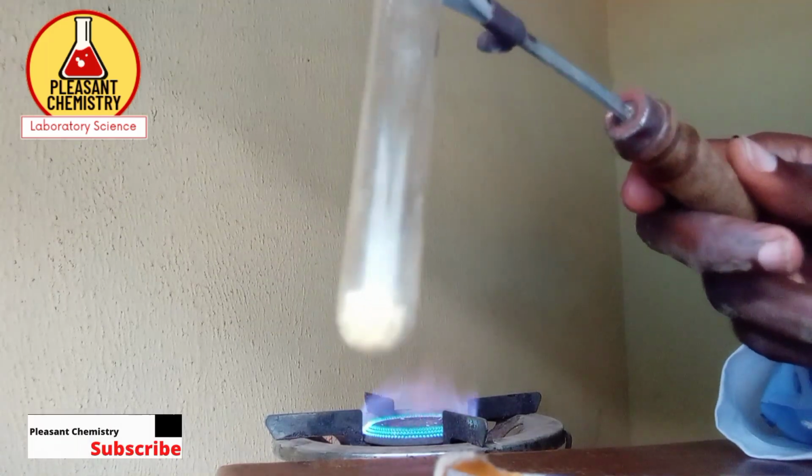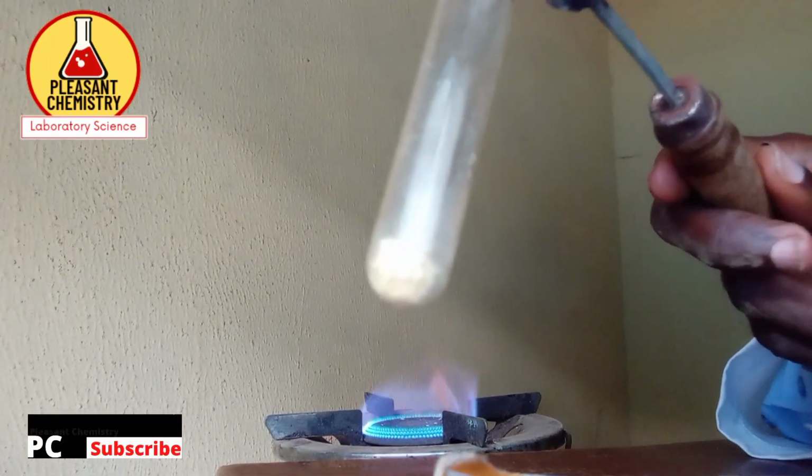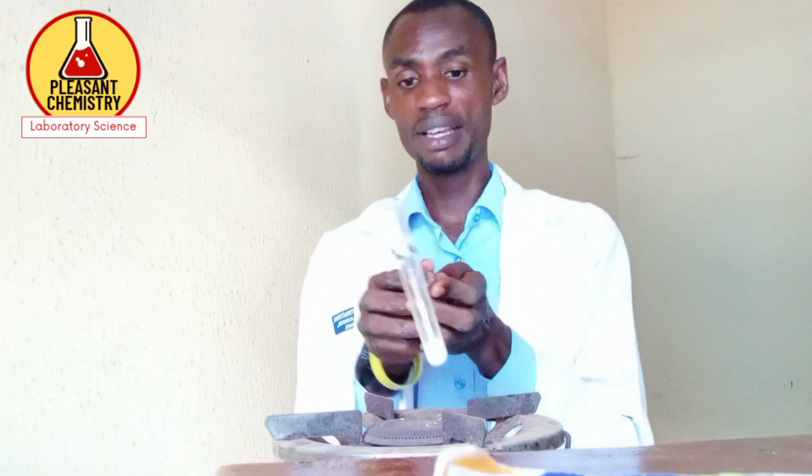So let's see what happens to sample D when it gets cold. Now our sample D is already cold, and when we look at it, it is turning white. Our sample D is cold now and has turned to white.